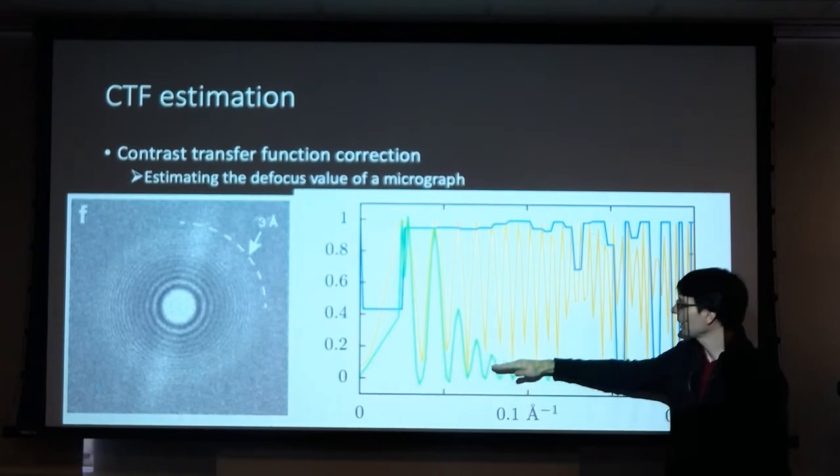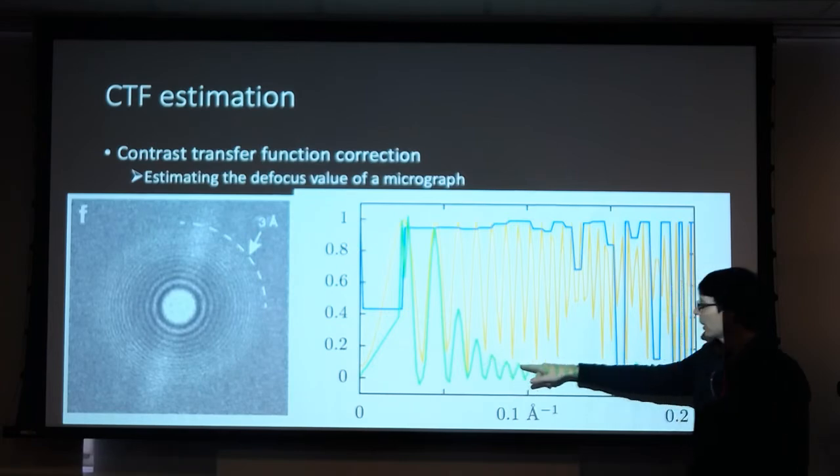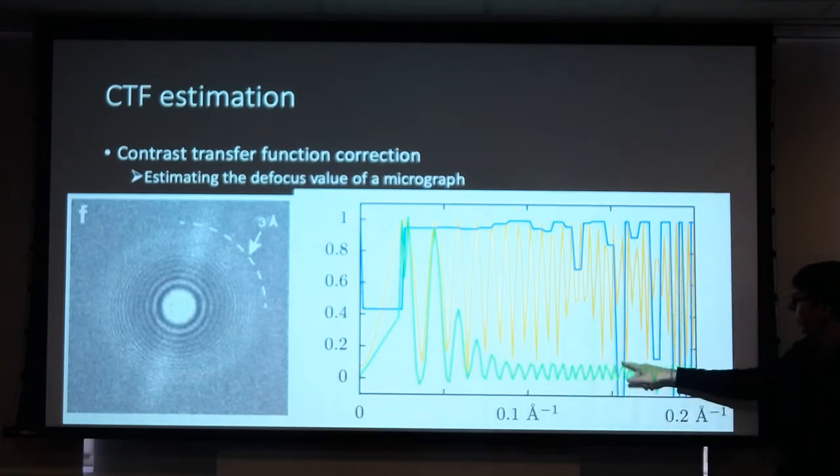It's a simple way to see it. Now the problem is that if you do that in that region where it's oscillating very fast, and the model is starting to not agree quite well with the data, now when you multiply one by the other, if they don't agree with each other, if they are not in phase, you get destructive interference.